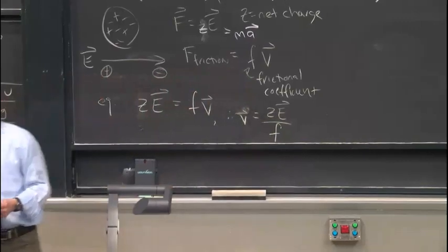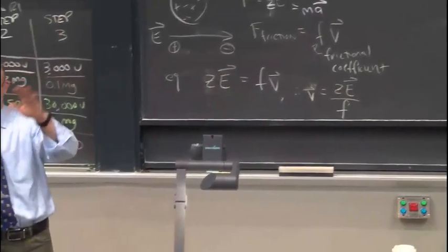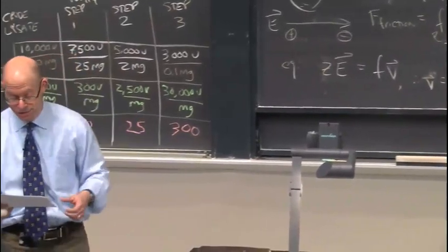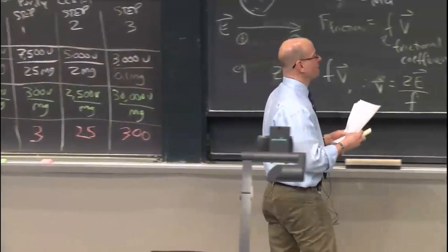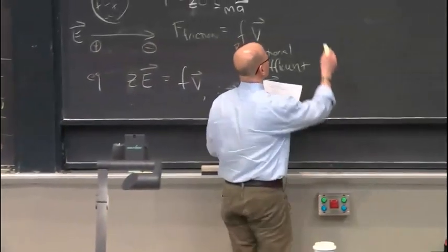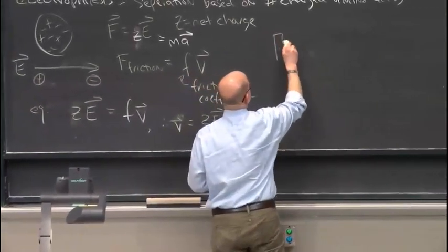Now, I can do this in solution. I can do it in a gel, something we'll talk about in a minute, that acts as a sieve. And if I do it in a gel, this is going to be called native gel electrophoresis.